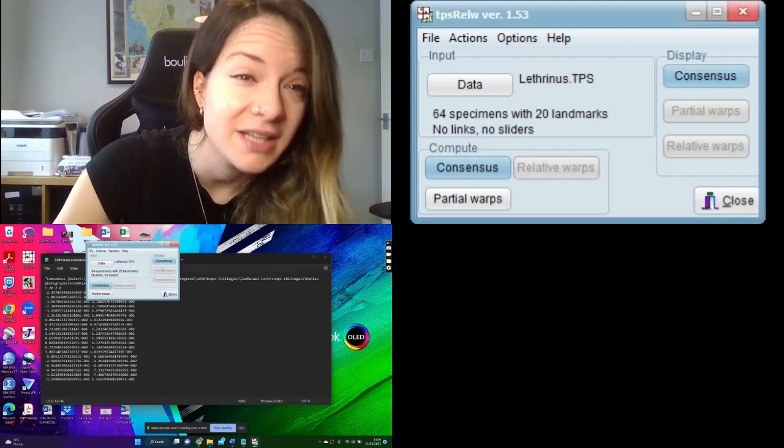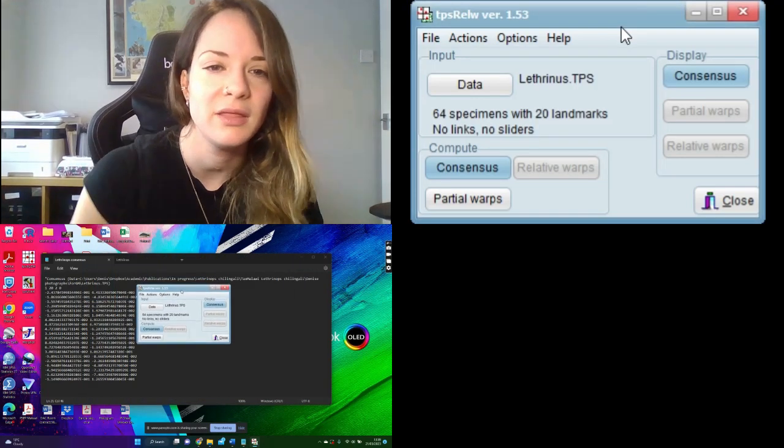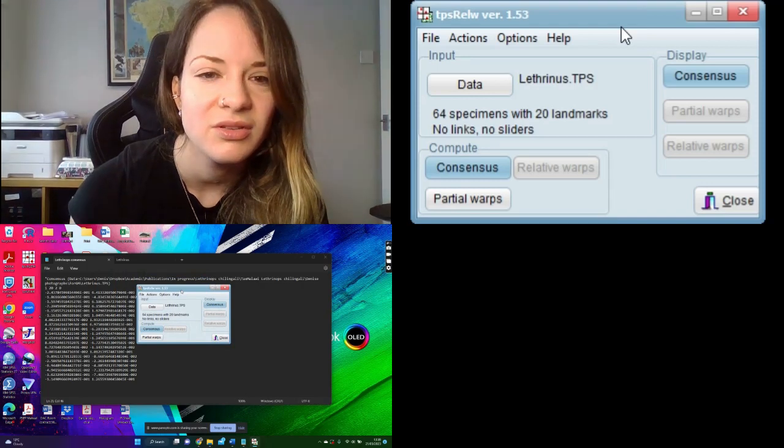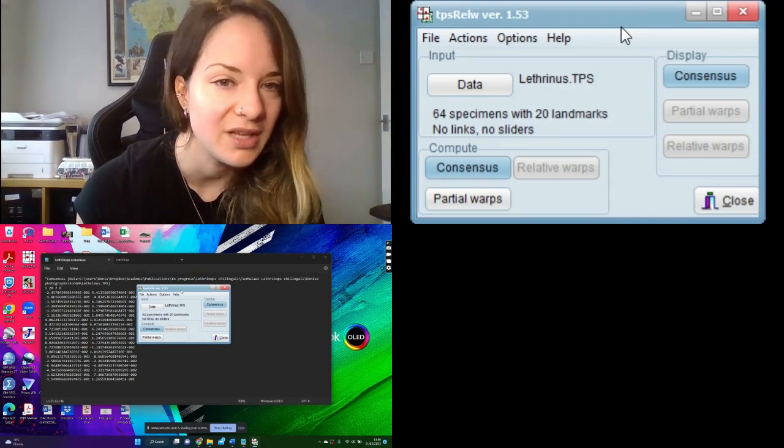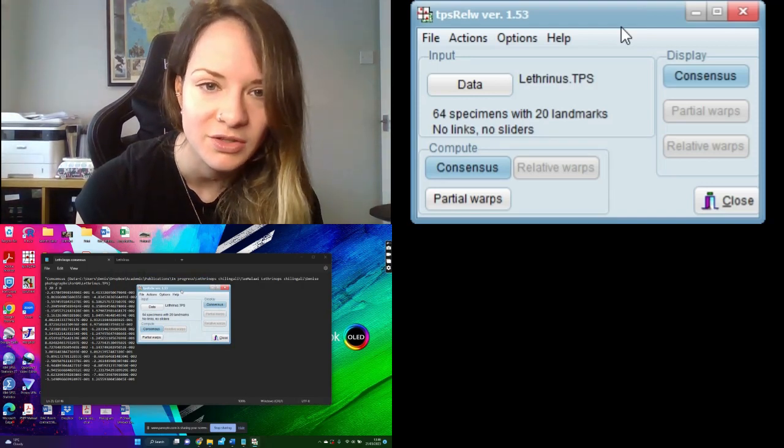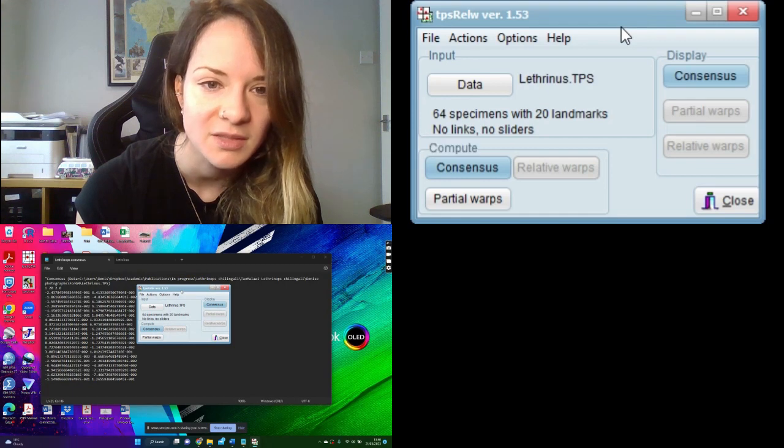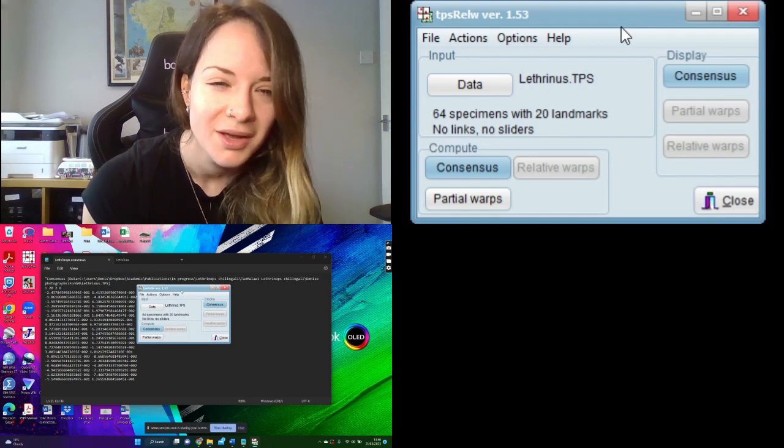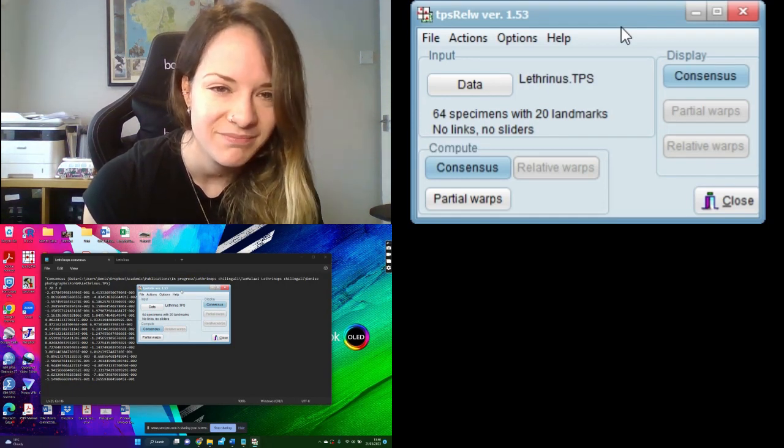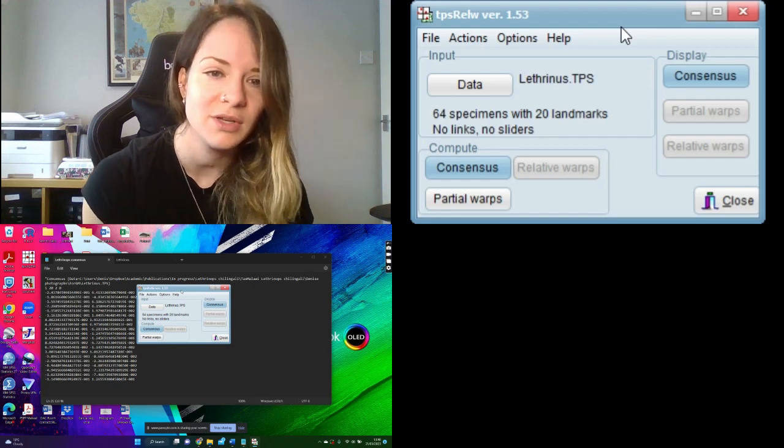So we've got the consensus there, but that doesn't really tell us anything about the shape variation in the data set. We know what the average is, but we don't really know how much any of the specimens differ from each other. There's not really much we can actually tell from that data on its own.